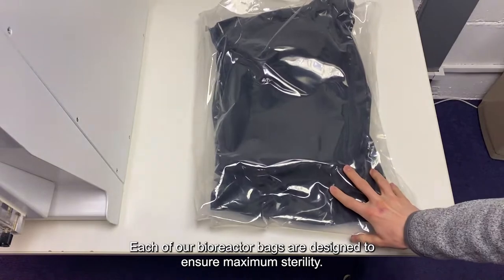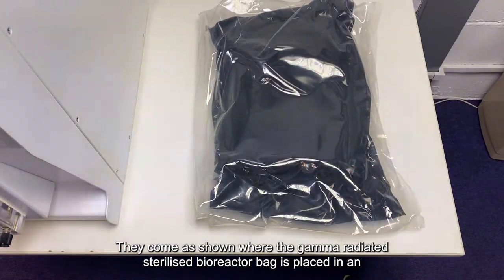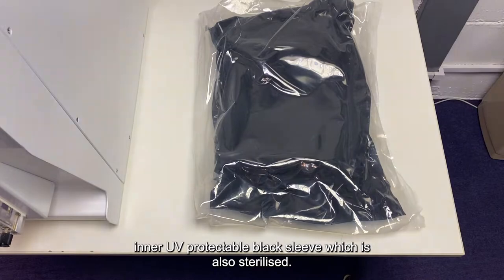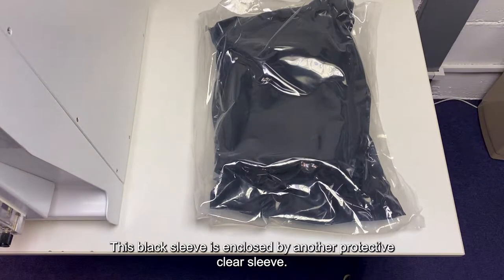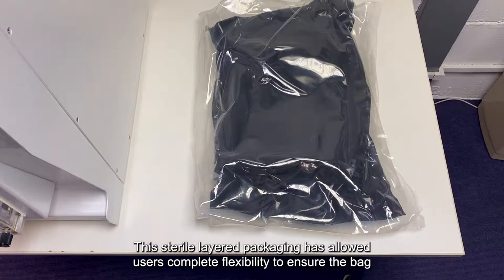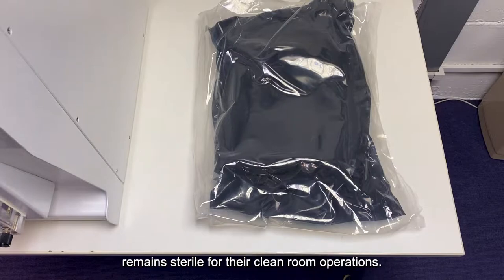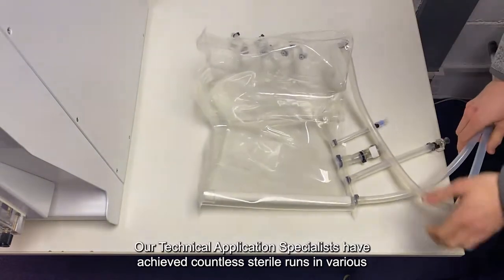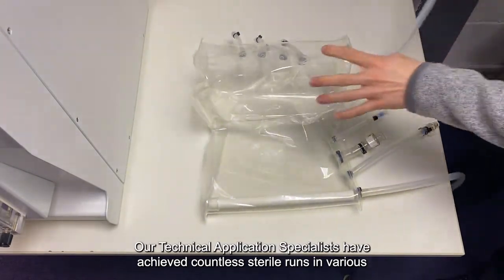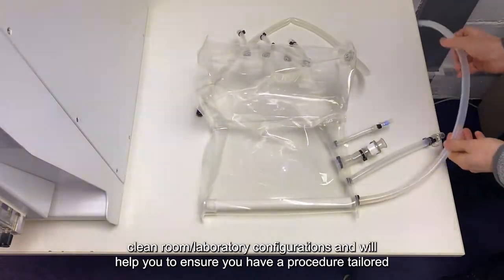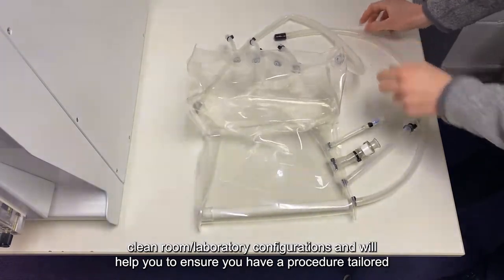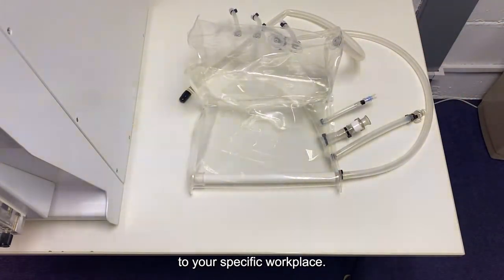Each of our bioreactor bags are designed to ensure maximum sterility. They come as shown, where the gamma radiated sterilised bioreactor bag is placed in an inner UV protectable black sleeve, which is also sterilised. This black sleeve is enclosed by another protective clear sleeve, and this sterile layered packaging has allowed users complete flexibility to ensure the bag remains sterile for their clean room operations. Our technical application specialists have achieved countless sterile runs in various clean room or laboratory configurations, and will help you to ensure that you have the procedure tailored for your specific workplace.